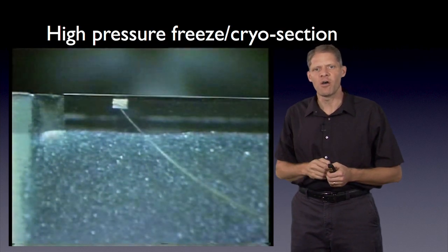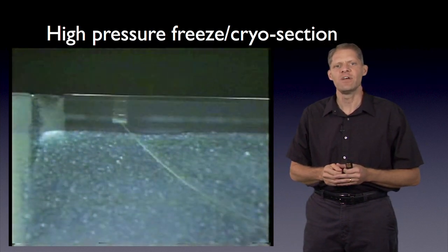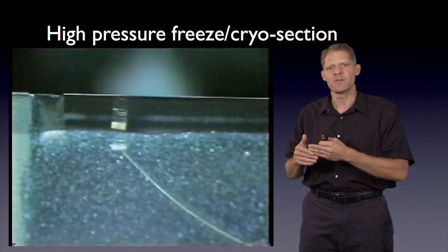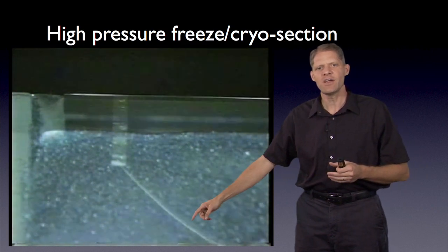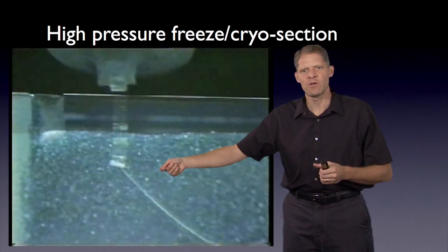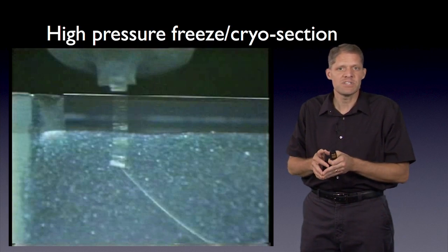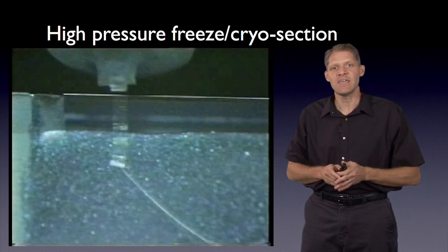As the microtome arm is brought back and forth across the sharp edge of the diamond knife, very thin sections of that high-pressure frozen material are being cut off, and they stick to one another so that they emerge as a ribbon of sections. Then down here, we see an eyelash that's being used to catch that ribbon of sections and draw it forward. So it is possible to cryosection high-pressure frozen material and take that ribbon of cryosections and lay them down on an EM grid.